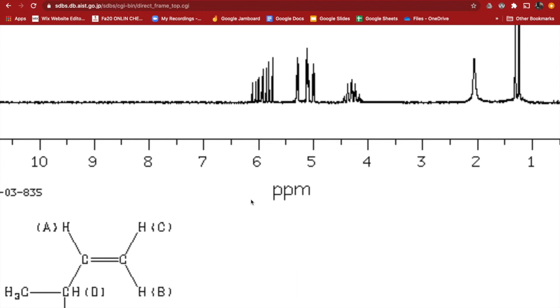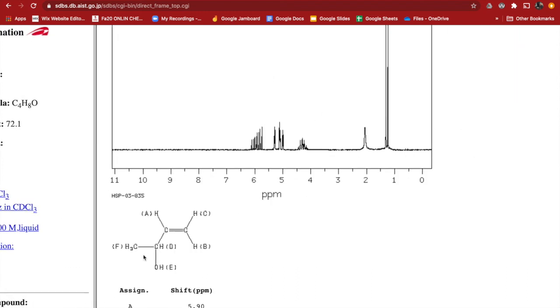And then next up, this guy, all by himself. How many neighbors does he see? So he sees 1, 2, 3. He sees these 3 and these 3. Oh no, just these 3, huh? We're going to assume oxygen cuts off the coupling. Yeah. So all he sees is those 3 neighbors, and this guy.